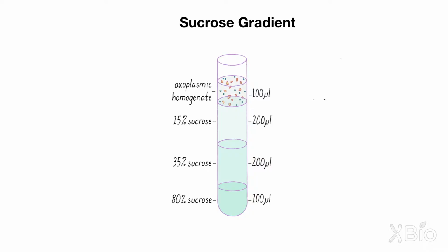But now keep adding more and more sucrose. Eventually, it gets very viscous and thick. That was the general solution that we used in this sucrose gradient, a very thick, viscous solution of sucrose. In fact, we made different percentages of sucrose.